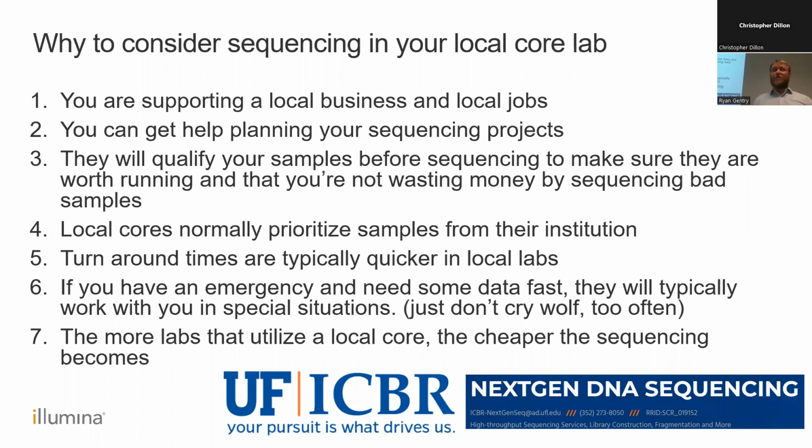Number one, you're supporting local jobs and local business. The second thing, you can get help planning some of your experiments, where if you use a send-out lab, all they're going to do is sequence your RNA or your DNA, and those send-out labs aren't going to test your DNA or RNA. What David and their lab are going to do is look at your DNA or RNA and say, this is good to run on a sequencer, or this is bad to run on a sequencer. And with that, they can save you money. Other things are turnaround times, or if you have grant projects that you need to get in, if you have that established friendship with the core, they may be able to get your samples back into the queue a little quicker, rather than a send-out that's probably going to put you at the back of the queue.